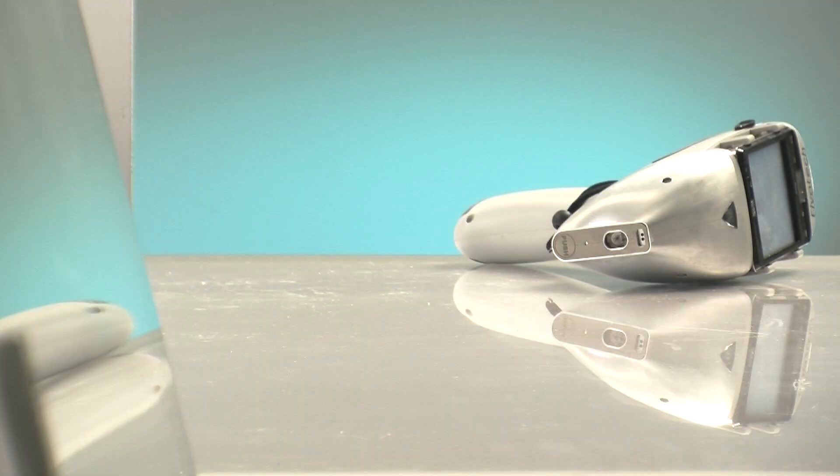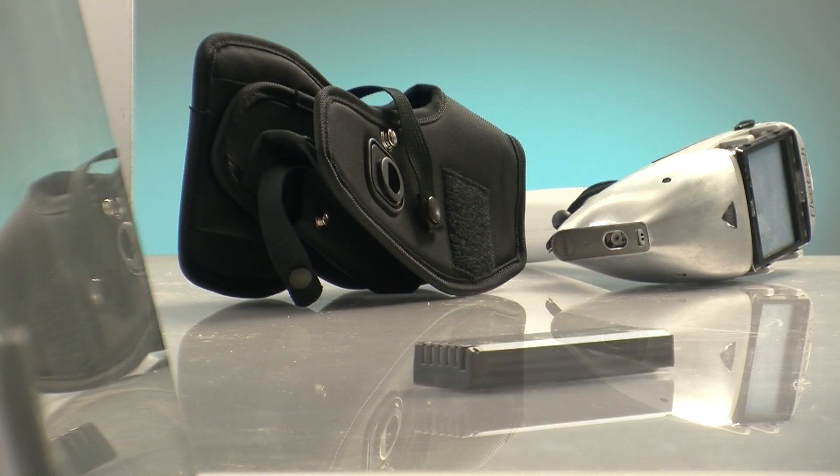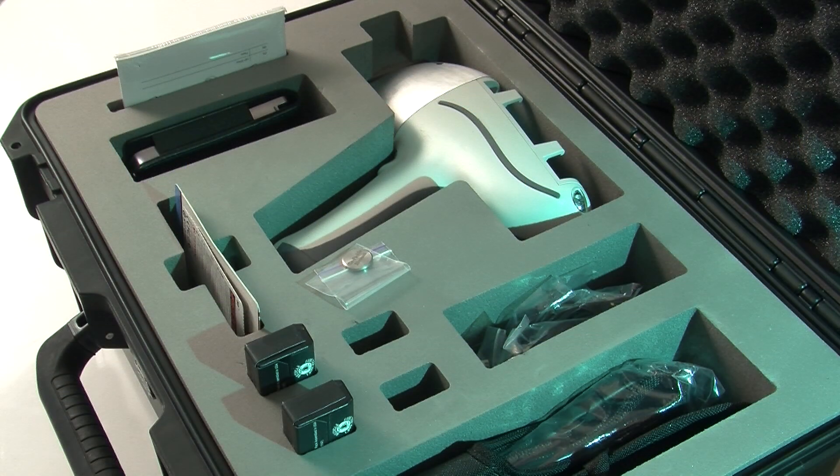Elvax Prospector delivery set includes a waterproof case and holster for convenient carrying. The battery has an operating time of 8 hours before charging is required.